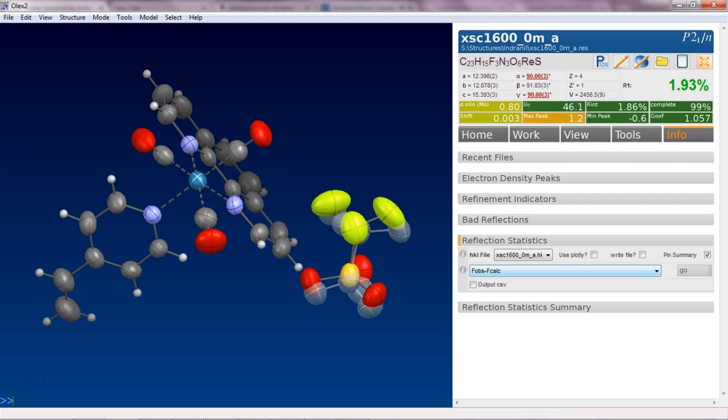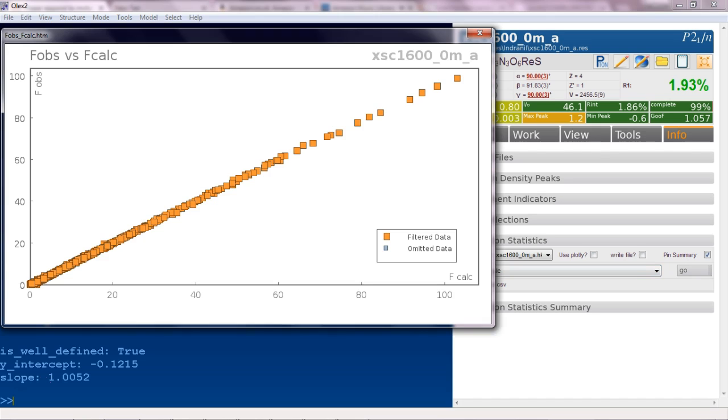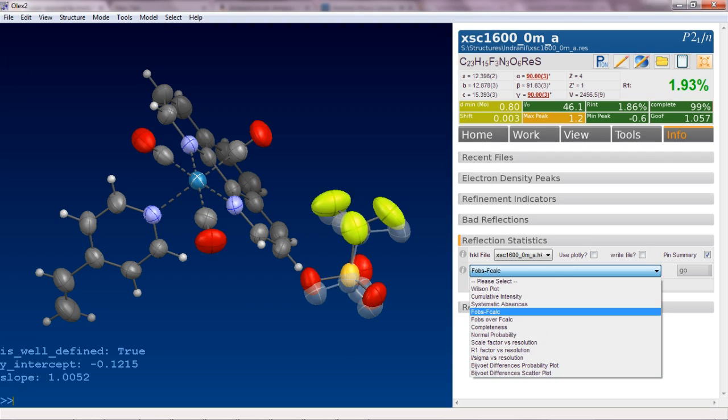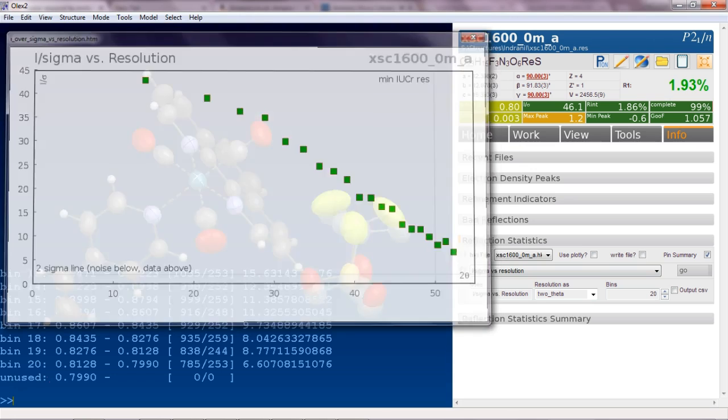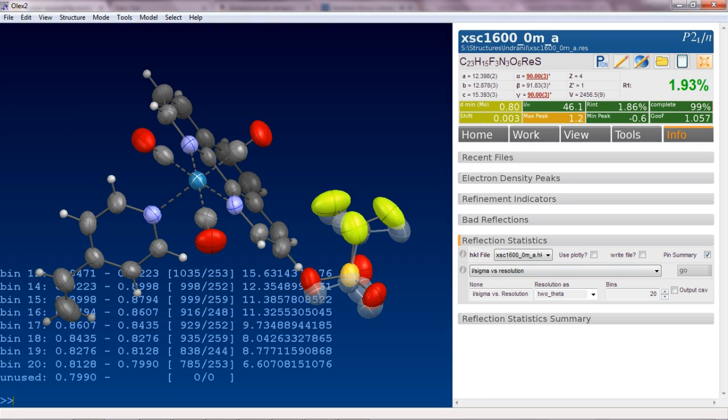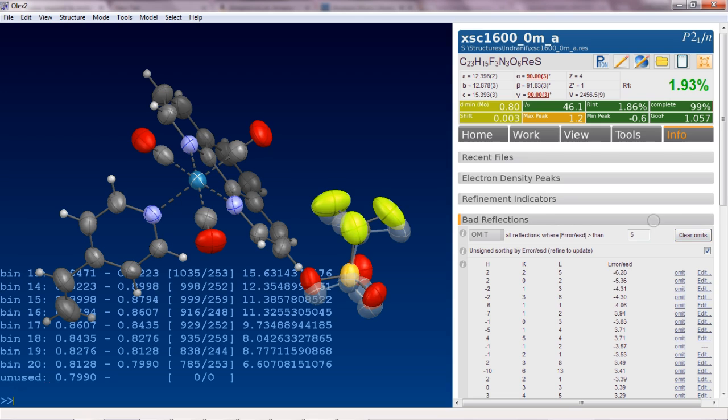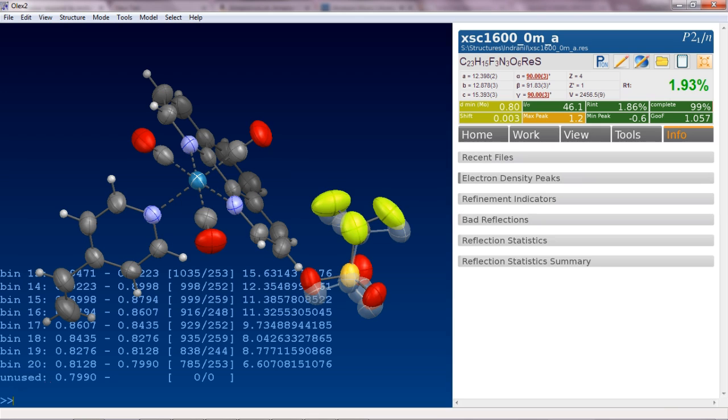Anyway, this wasn't the point. The point is now I'm heading over to info. And let's have a look at the diagnostics here. Observed versus calc, that's the most important plot. And that looks absolutely perfect. So there's nothing really going on at all that's suspicious. And let's look at the I over sigma versus resolution. Very nice reflections, we should have done this first really, but we know we've got a good data set. It goes all the way out to here. I'm surprised it wasn't collected further out. So there's no reason to cut this at 50 to 53 degrees, because obviously there's really good data still coming in. So a better structure would have resulted if more had been collected, but it obviously fulfills the IUCr criteria. Last look at the bad reflections, and there's nothing here. So there really wasn't any reason to omit any of those reflections that were omitted in the first place.